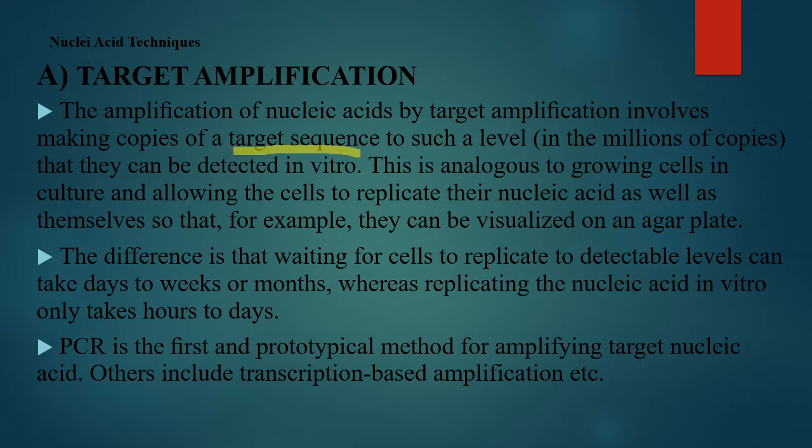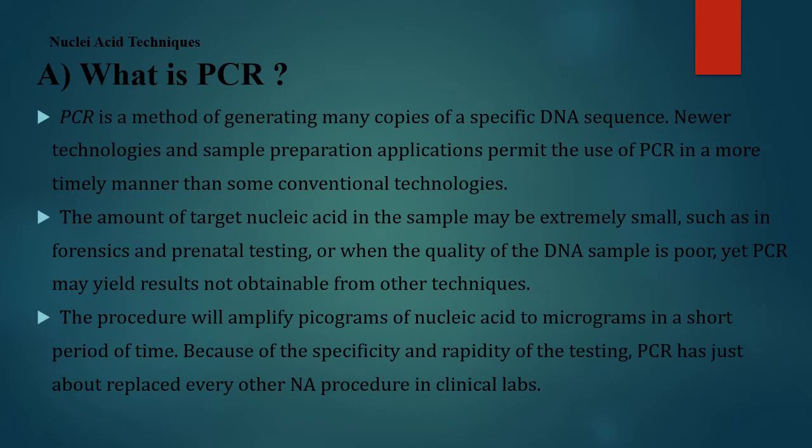So PCR is the first and prototypical method for amplifying target nucleic acid. Now there are other ways of going about transcription-based amplification, etc. PCR is the first that was found. So let's talk about PCR. You've heard PCR, PCR, PCR.